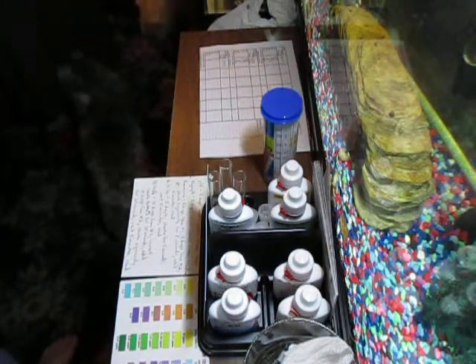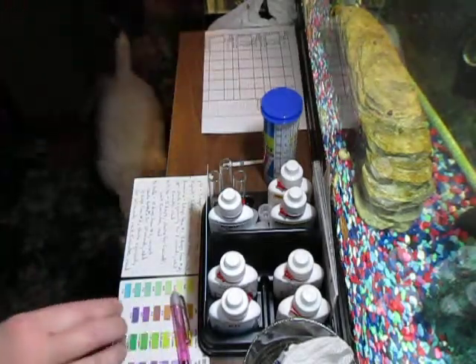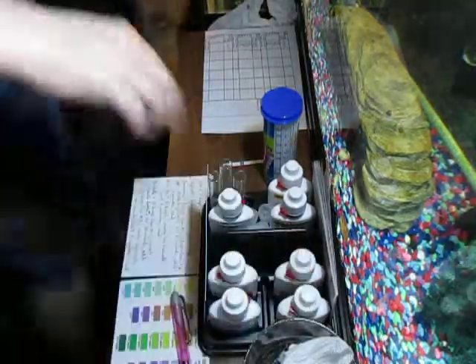I'm going to go ahead and fill up a test tube and show you how to do the nitrate with the API master kit.